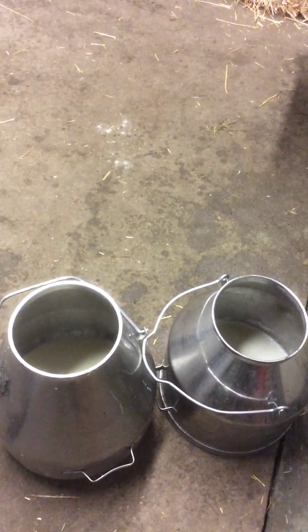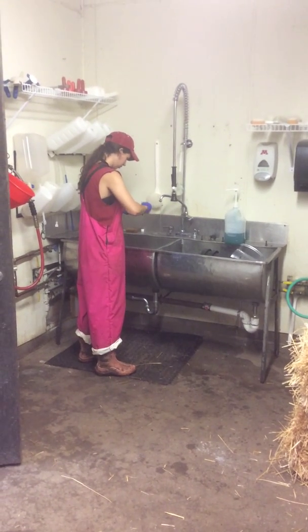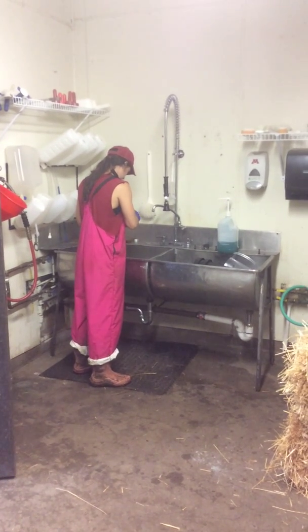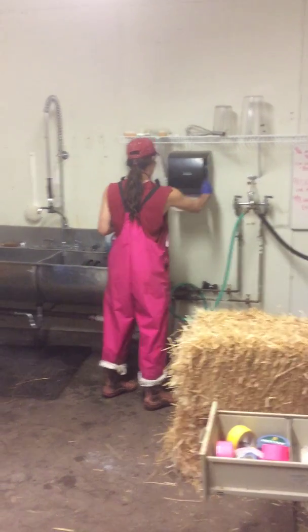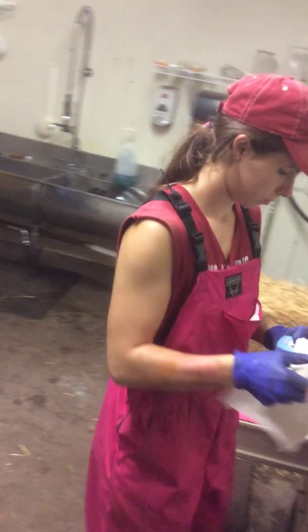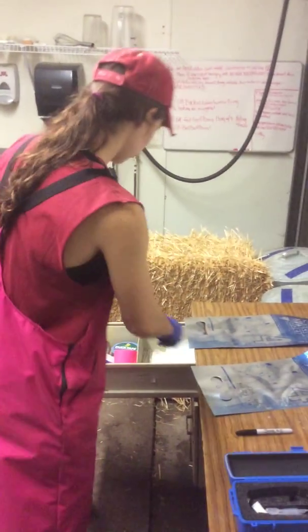We have two milkings here and so we're about to do the second reading. In between BRICS readings, always be sure to clean off the silver metal part of the BRICS. A simple rinse and dry is sufficient to clean the silver monitor.